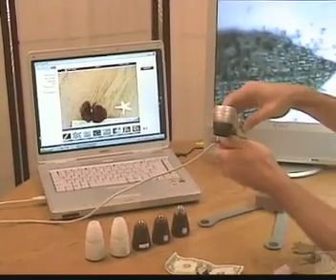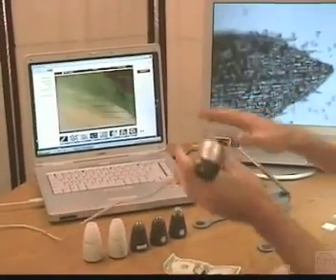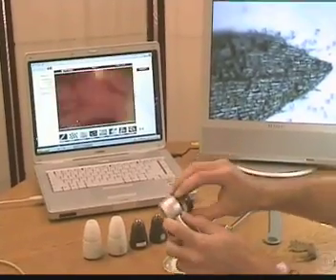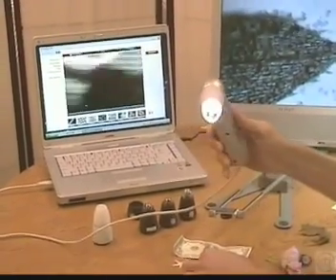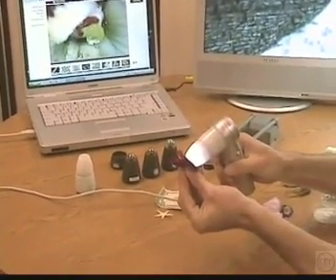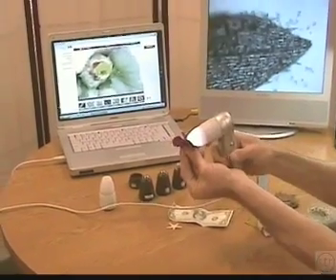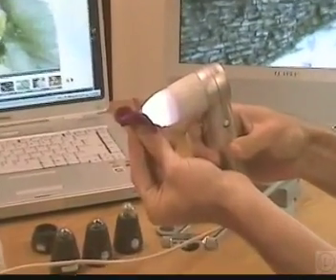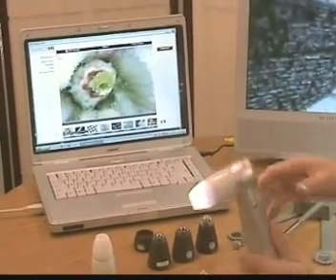I'll take the ProScope off the stand now and put the 50x lens on and use the ProScope in handheld mode. The lenses are easy to change. Now whatever I touch with the tip of the lens is magnified and displayed live on the computer screen. If I like this picture of the inside of the flower, there's a button on the ProScope that I simply touch and now that image is saved right on the computer as a JPEG file.